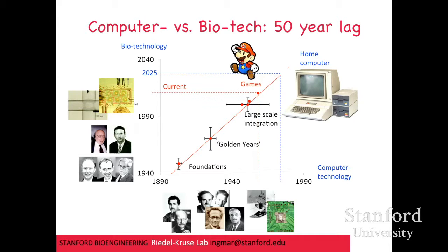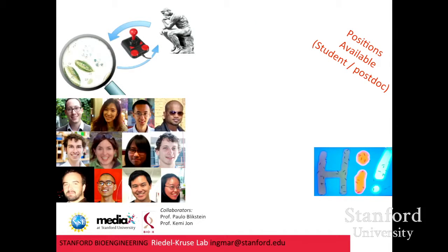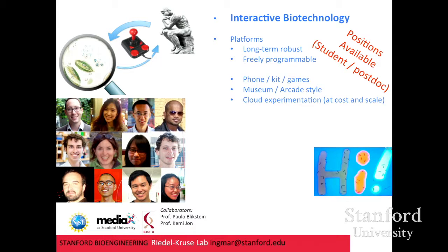So, bright future ahead. Let me thank my lab, which is over there. Half of them work on that, the other half work on more conventional life sciences, so to speak. Just to summarize, I told you about interactive biotechnology. We have a number of platforms, and we spent a long time making them robust and freely programmable, and that's an ongoing theme. We use them in different setups: self-builder kit, museums, clouds. This concept of the biotic processing unit is an abstraction of a device that basically everyone could use, even if that person wouldn't know anything about biology.